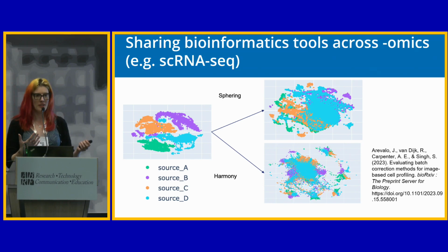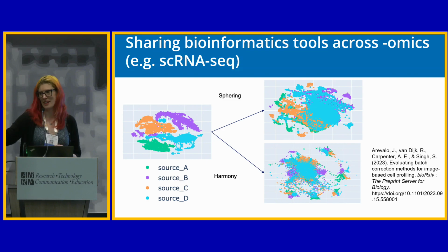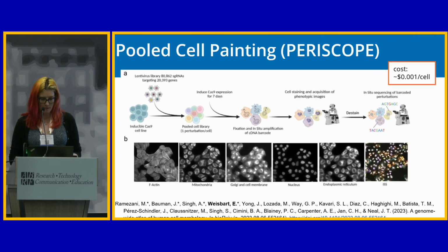That's a cool thing, since again this is just quantitative numbers, so we can take tools developed anywhere in bioinformatics, and we can then apply them, expand upon those methods, use them for our morphological profiling, and hopefully even develop new methods that can then be taken elsewhere as well.